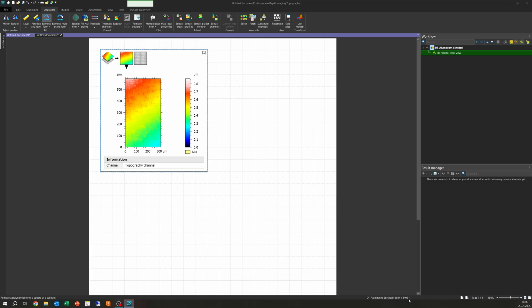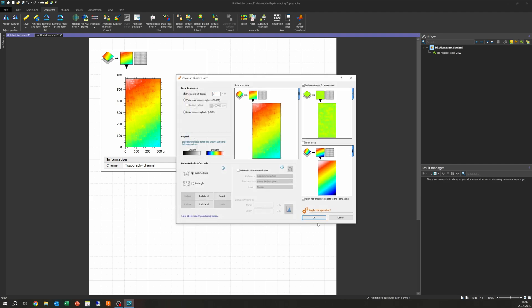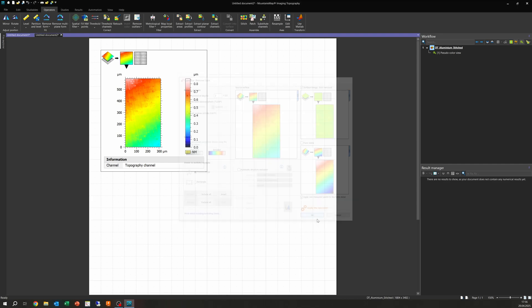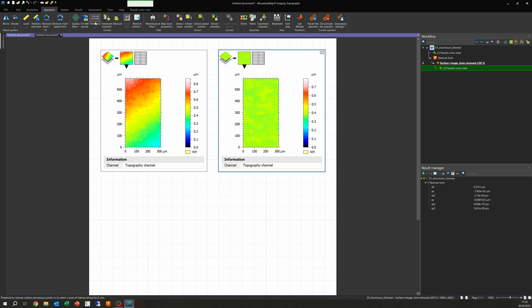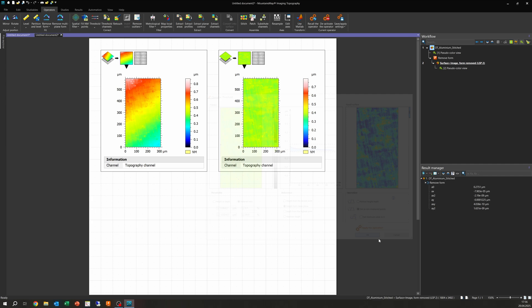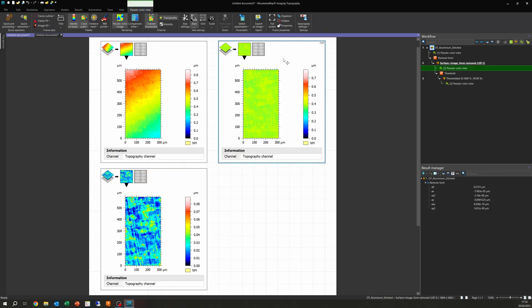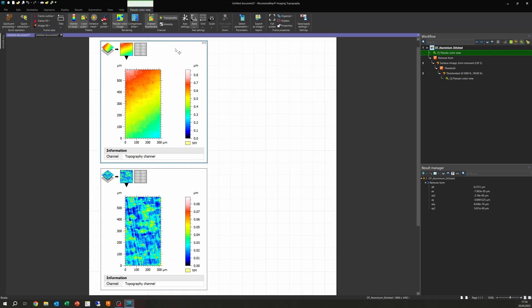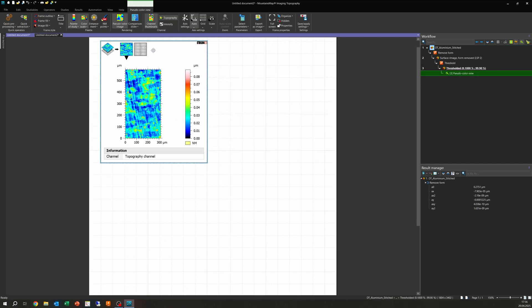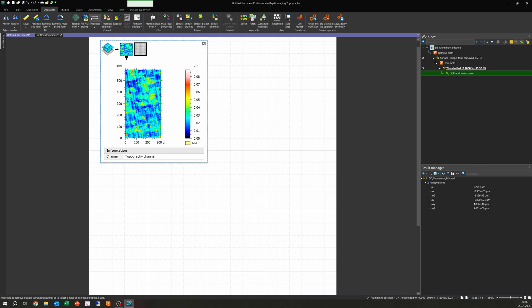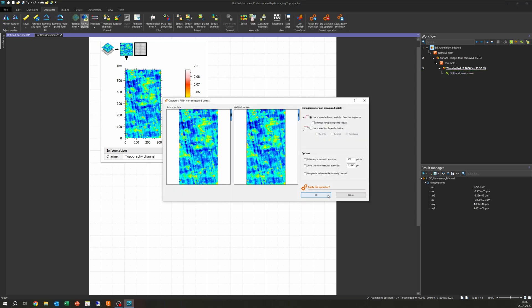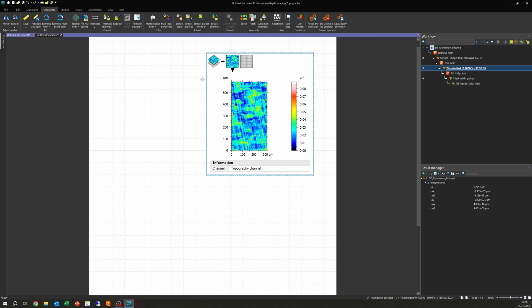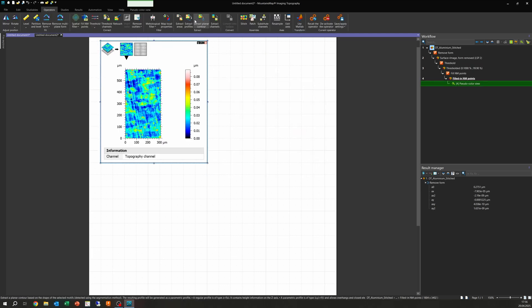Back in MountainsMap, we basically go through the same process chain. So first, we need to remove form as this is a very flat part. We are just removing the tilt, so we use a polynomial of the second degree. Then we are cutting off some outliers, filling up the non-measured points once again, using a smooth shape calculated from the neighbors. And we are pretty much immediately able to calculate surface roughness again.